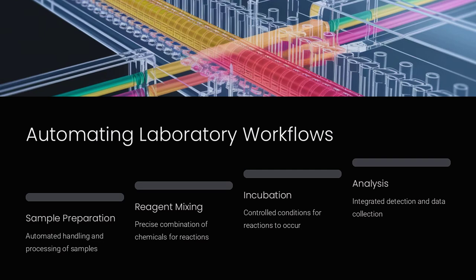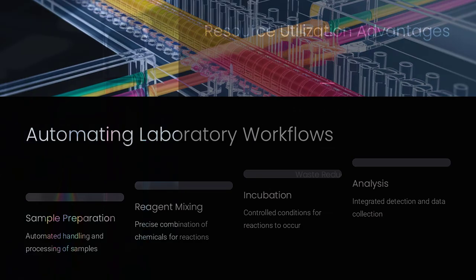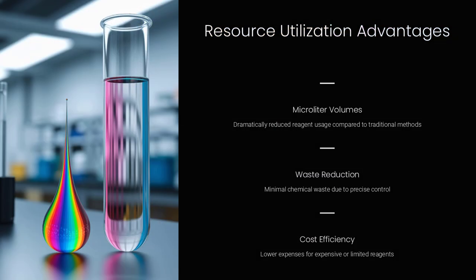Digital microfluidic systems are highly reconfigurable, allowing for dynamic changes in workflow without physical modifications to the device. These platforms are programmable through software, enabling automated execution of various laboratory protocols. The flexibility of these devices means they can be quickly adapted to perform different tasks as research needs evolve, with reconfiguration achieved by altering the electrical patterns applied to the electrodes.